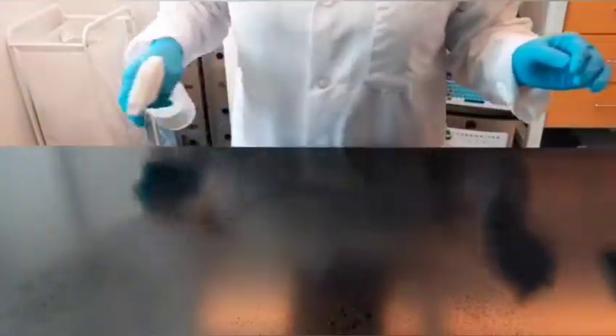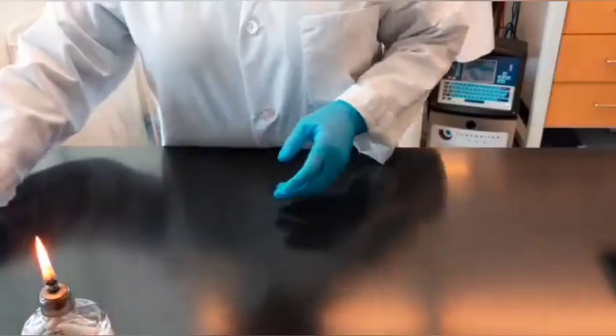For any work performed at the bench, we recommend decontaminating your bench by wiping down with 70% isopropanol or ethanol. Now you can set up the materials needed for inoculation.